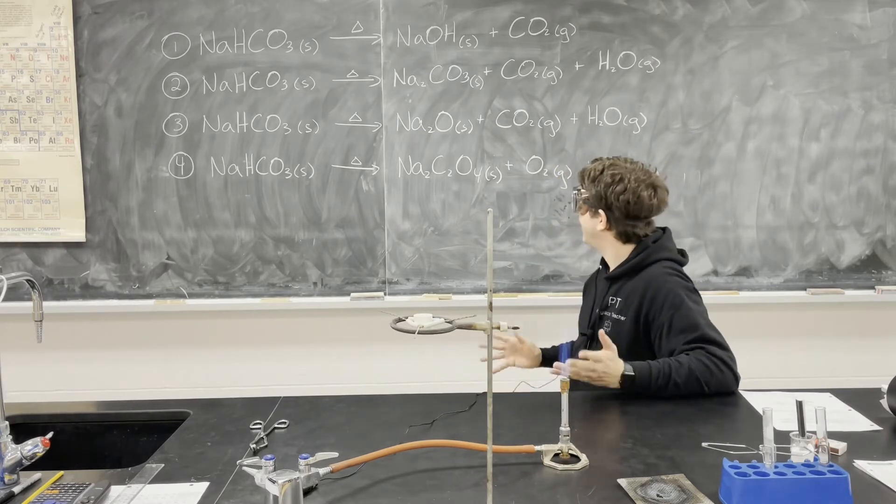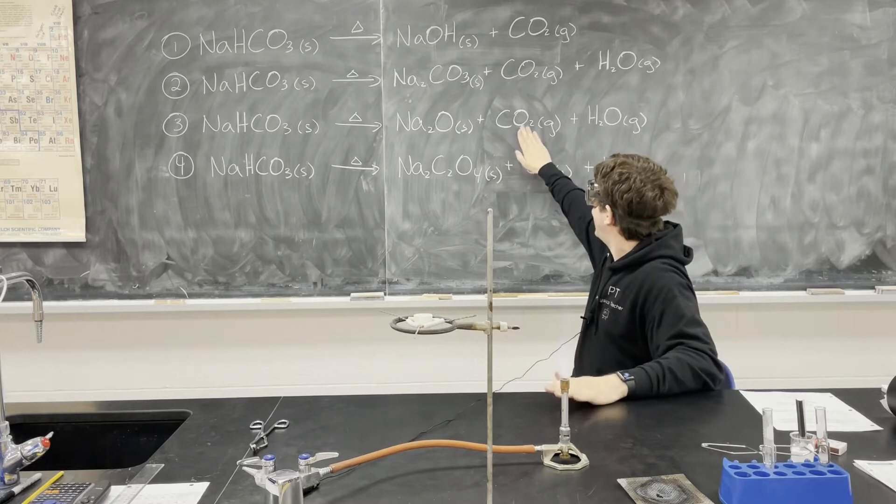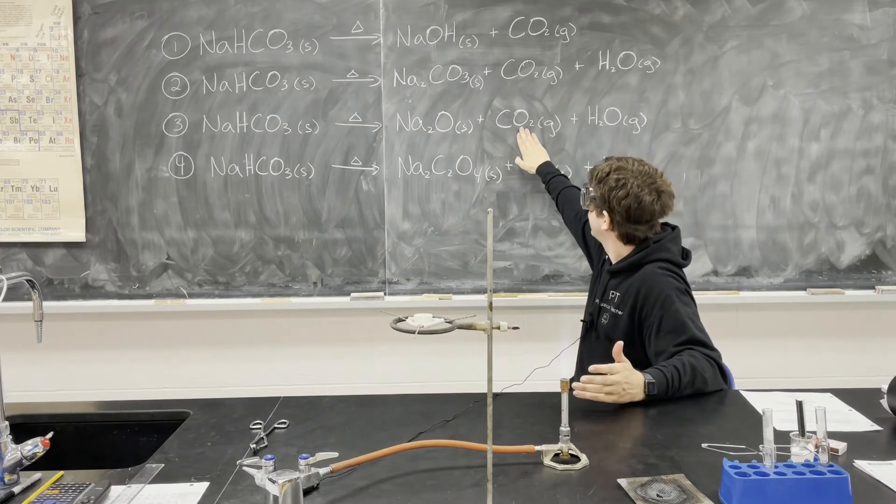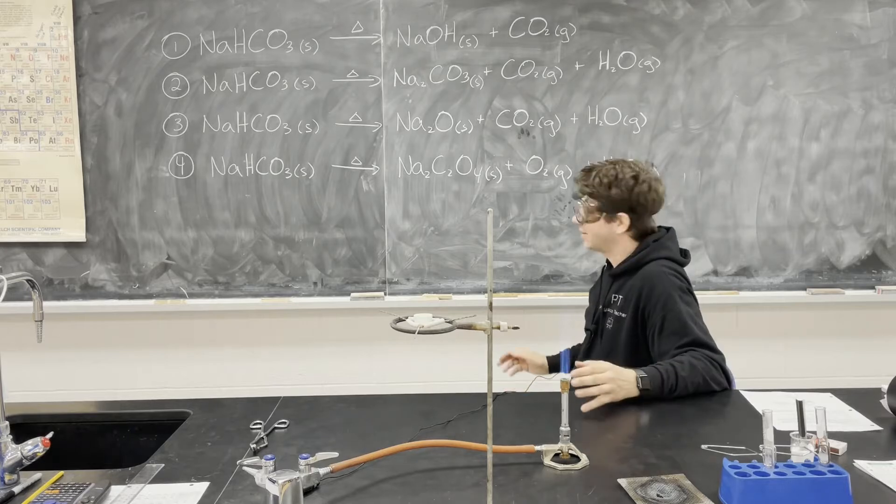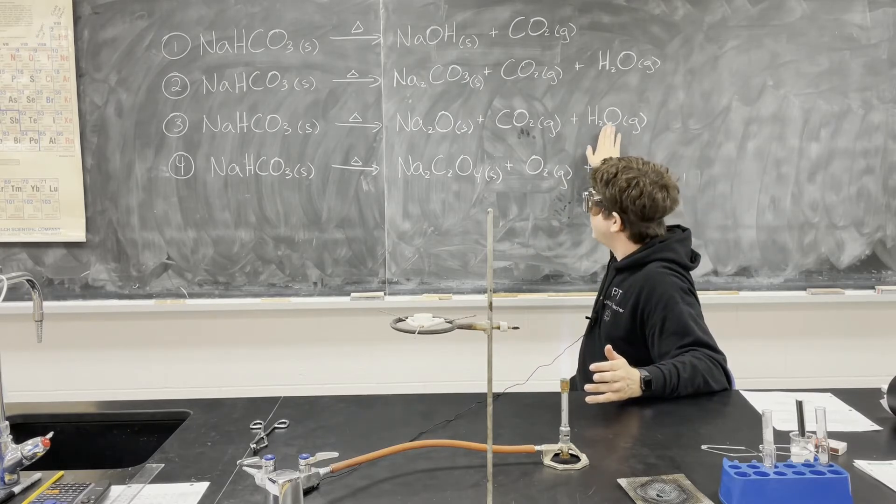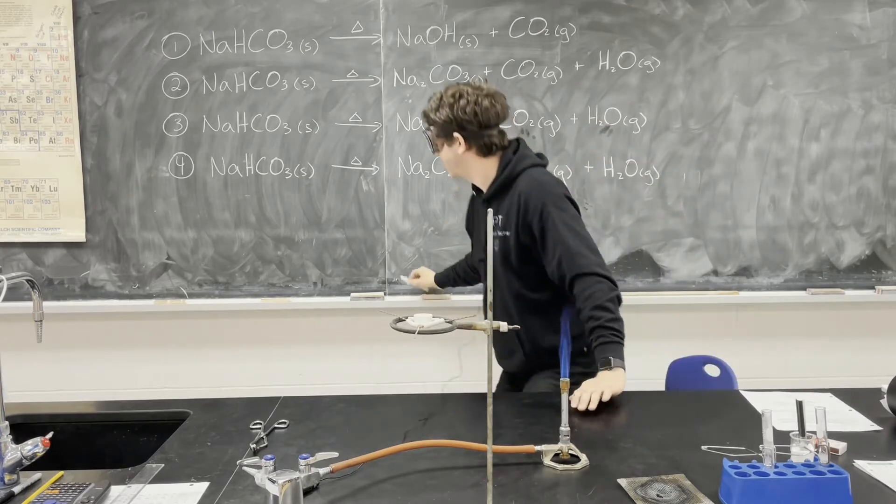So, we can clearly see we get a precipitate, so we have carbon dioxide. And you can probably guess that that condensation is water, so we have water. But just for now, let's cross off number four.